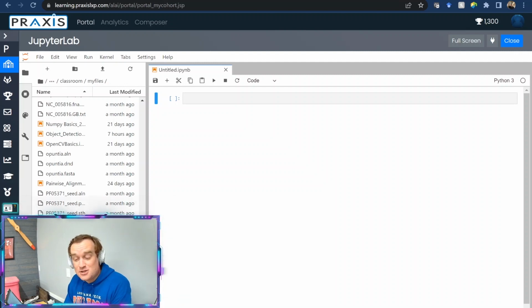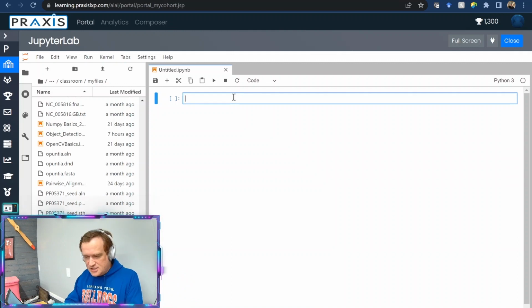In my case, with root angle measurements, cutting out all the noise and just finding the edges of the root to measure the change in angle would be useful. There's a whole bunch of automated phenotyping you can do with it. So let's get started.